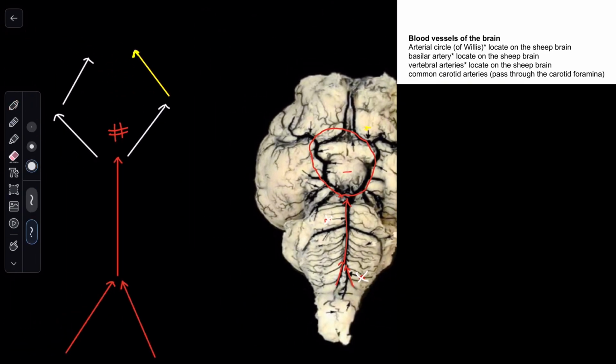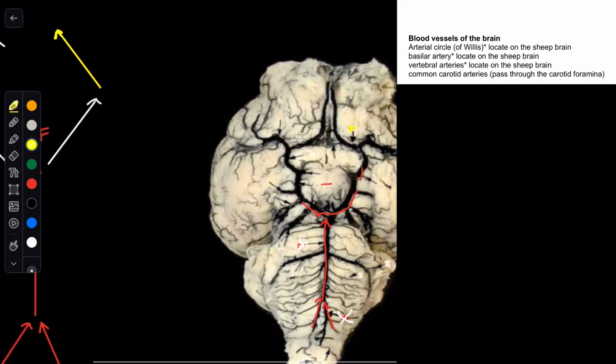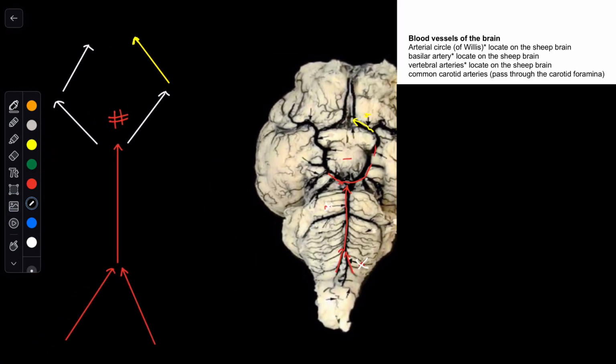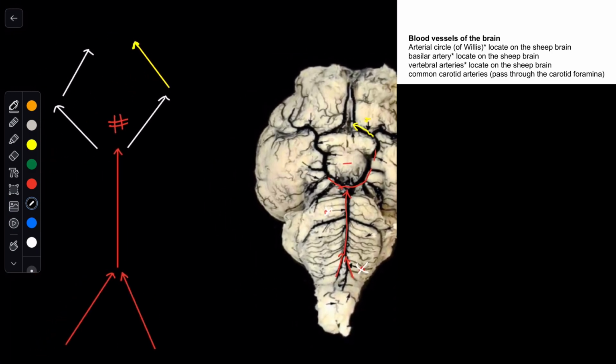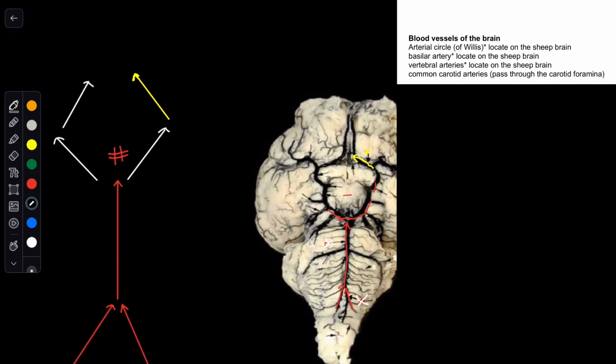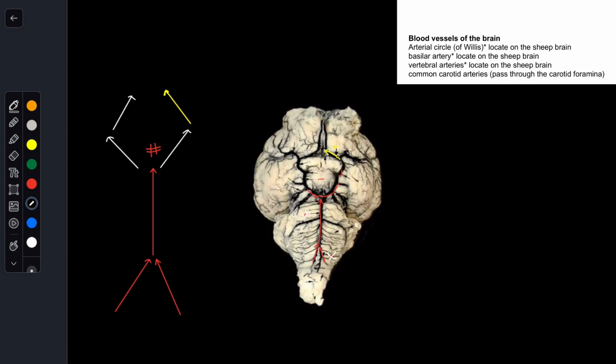Before I continue, I want to say something. This yellow structure, I couldn't find the common carotid artery, so the closest one I could find was the internal carotid artery, which is this one right here. But I'm pretty sure that's not on the lab list, so I really don't know. You have to ask Dodenhoff regarding the common carotid artery, because this is the closest I can find, the internal carotid artery. And that should be it with the lab list for the brains.